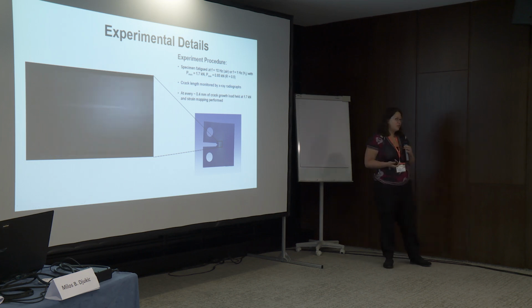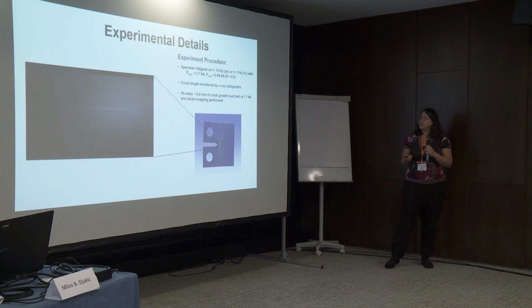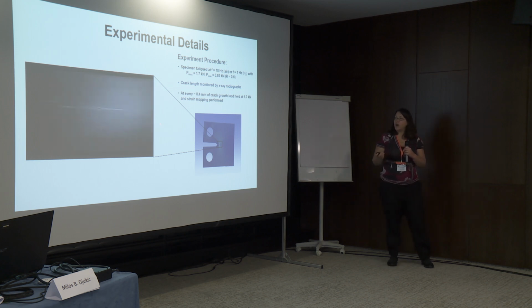So what we do in the facilities, we fatigue the specimen. We do it both in air and in hydrogen, and then we observe the crack length by these X-ray radiographs, as you can see. And then when the crack progresses to certain points, we pause the fatiguing and hold it at the maximum load and do the mapping with the X-rays.